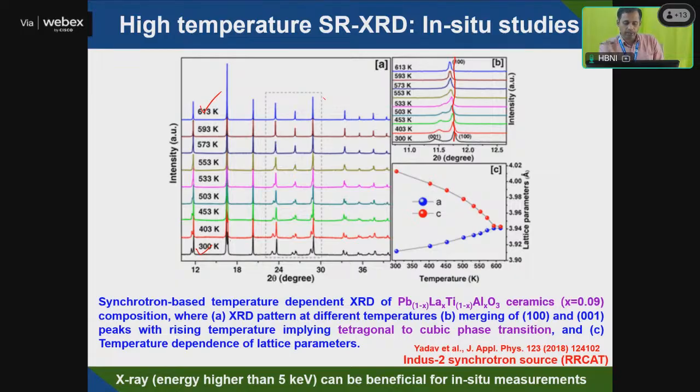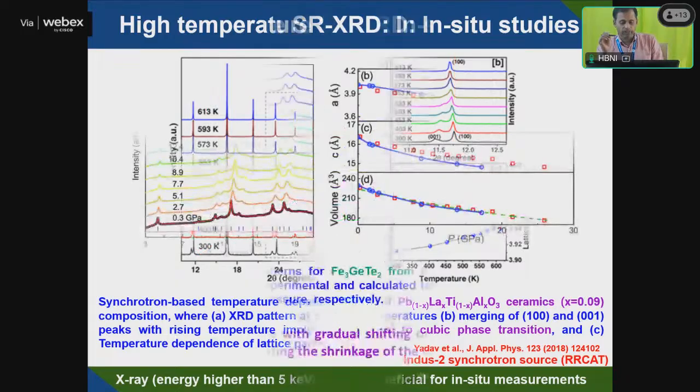When this temperature effect is identified, you can see how the lattice parameter a or c changes. Those information you can also get in conventional XRD, but with synchrotron XRD, as well as conventional XRD, high temperature XRD can be taken. You can get better information with this X-ray diffraction technique.